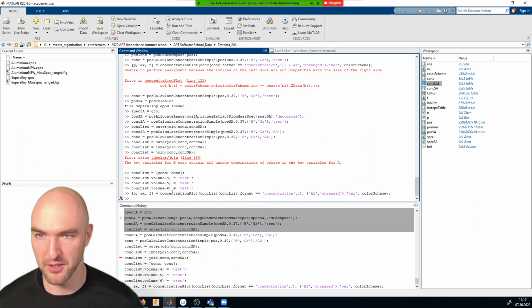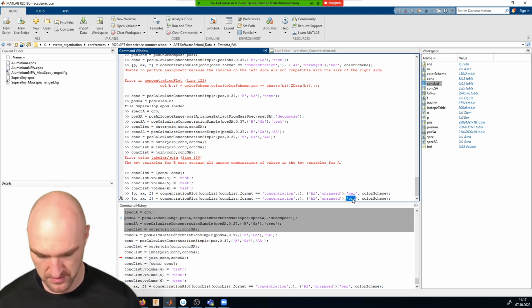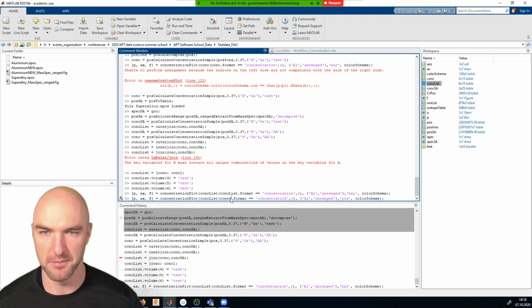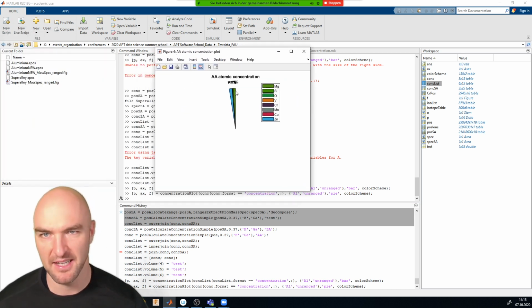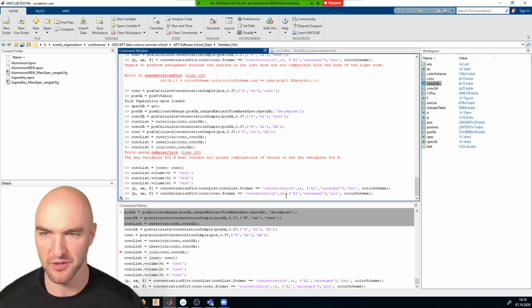And for the pie plots, we can change this to pie. And a pie plot, obviously, you can only do for one single concentration variable. Anything else doesn't really make much sense. A pie plot also doesn't make much sense if we leave out the aluminium. Sorry about that. And the unranged.